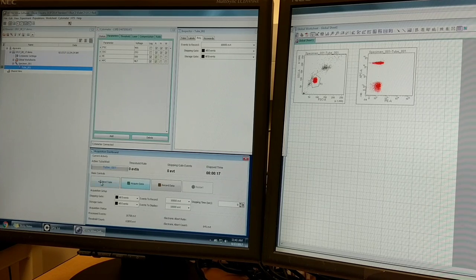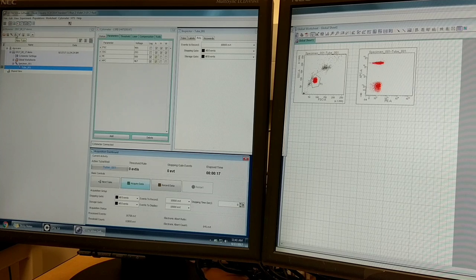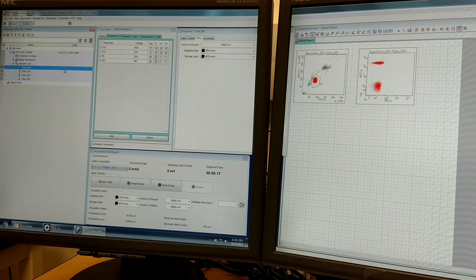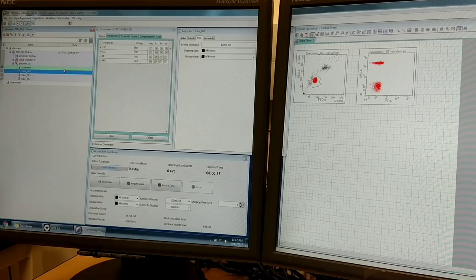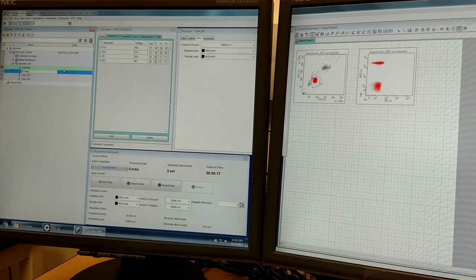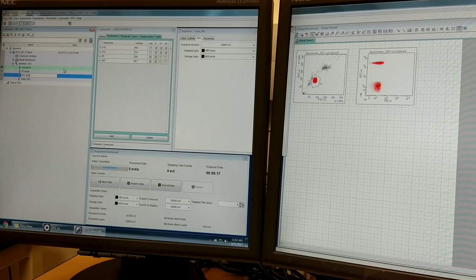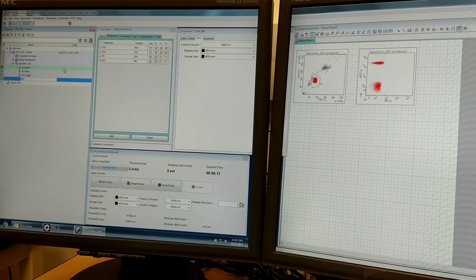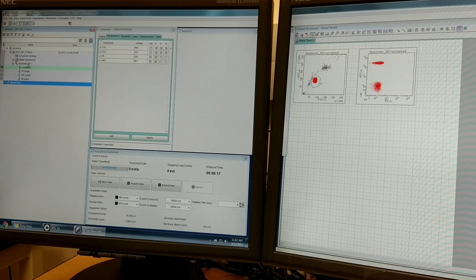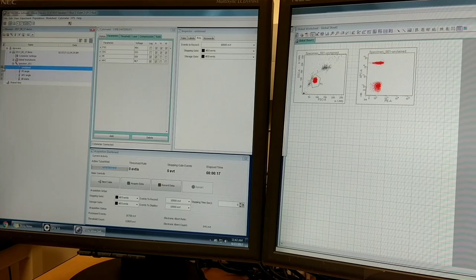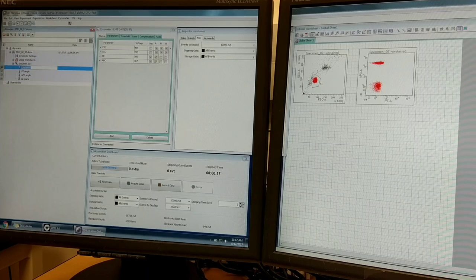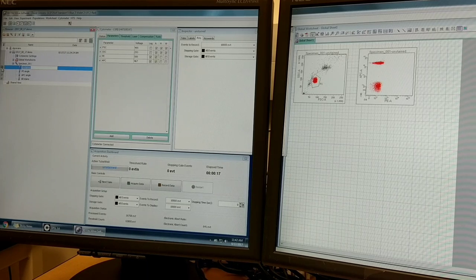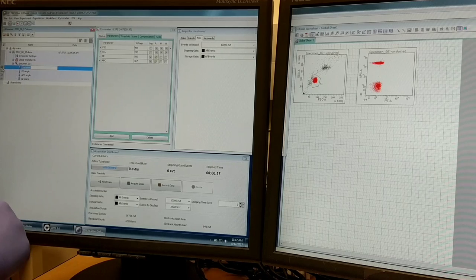The first step is we want to make the appropriate number of tubes. I have four tubes. I'm going to click on this new tube icon just to make four tubes. I'm going to label the first one unstained, the second one PE single, the third one APC single, and the fourth one all stains. Now make sure you have the appropriate one highlighted with the green button next to it checked. That's the one that you're going to be recording.